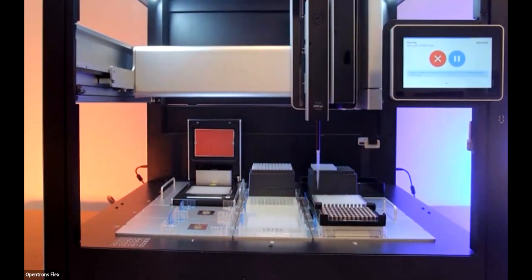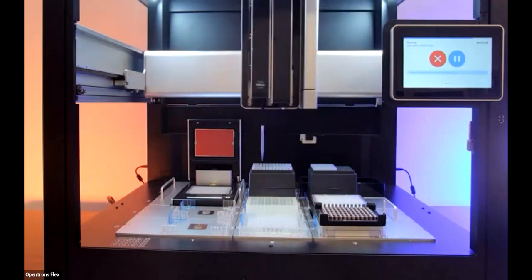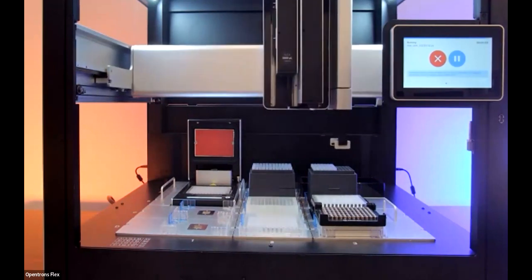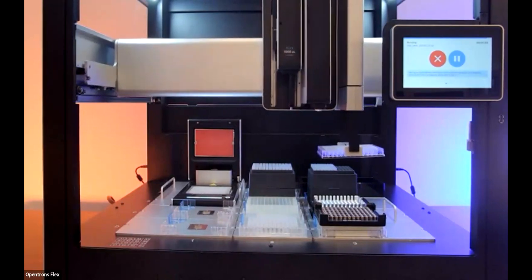So I haven't heard anyone speaking specifically to this pain point. The nozzles of the pipettes are a similar configuration. I don't believe there's any software or firmware level configuration that we have. So I believe it's a very similar process in terms of dropping the tips. But I haven't heard that exact complaint or comment before. So I haven't really heard anything about a change for the Flex.